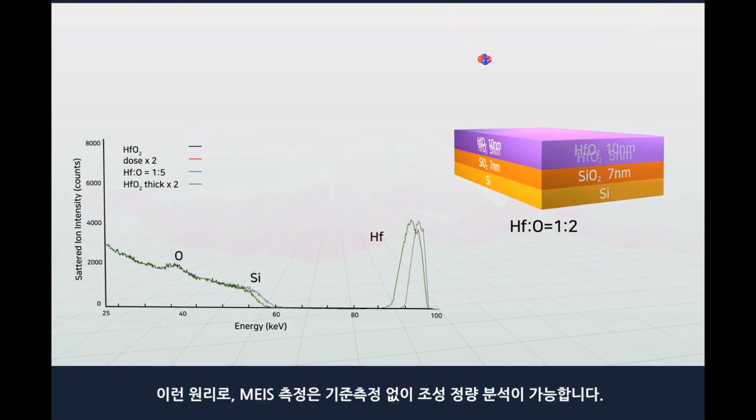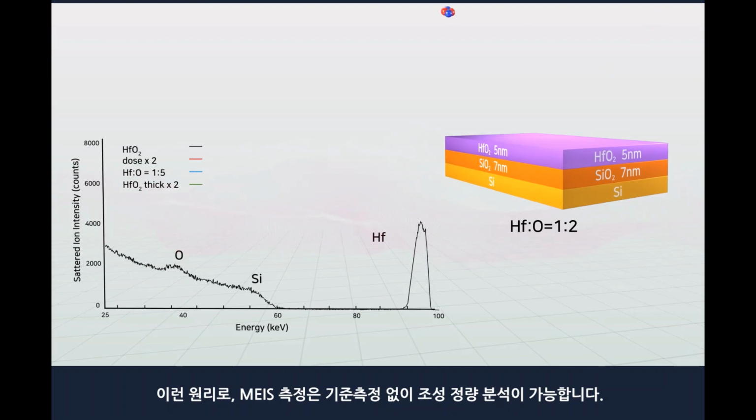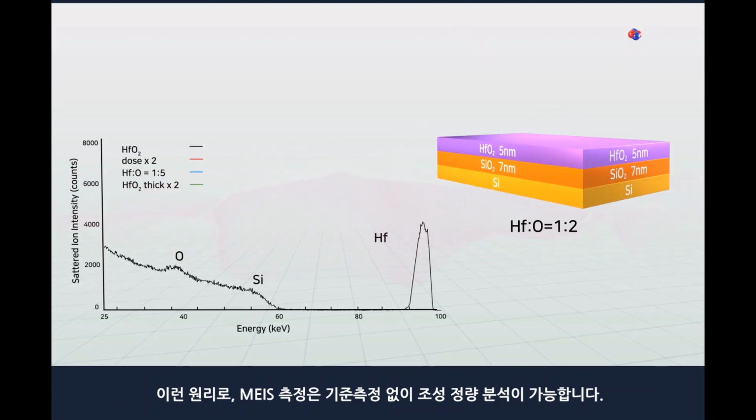In conclusion, MEIS measurements can be used to perform quantitative analysis without a reference measurement.